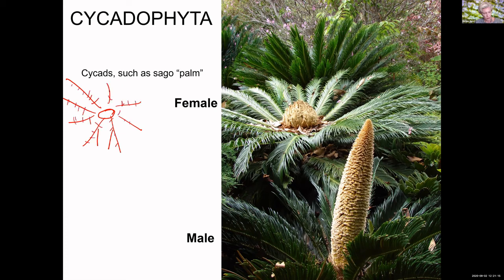It can also grow these sort of stalks up out of the ground and have even more ferny looking leaves on them. There's always going to be an empty space in the middle. And the empty space in the middle, sorry, this looks like a sea anemone more or less, is because that's where these reproductive structures are going to grow. So this is a cone. There's a female cone. These are cone plants, remember. Seeds are going to grow out of it.